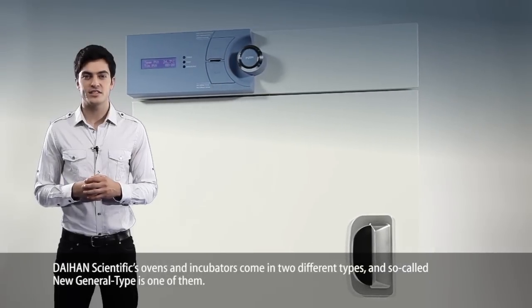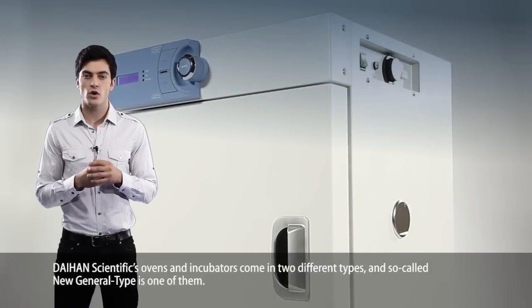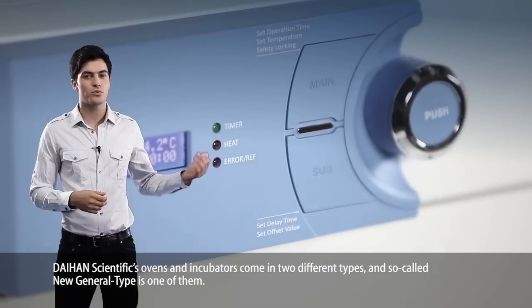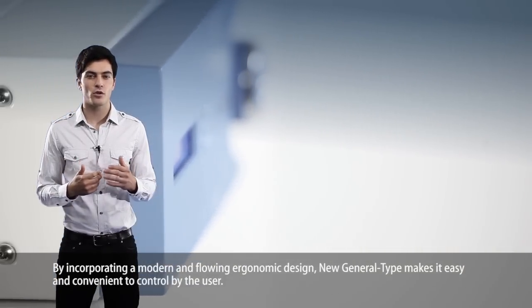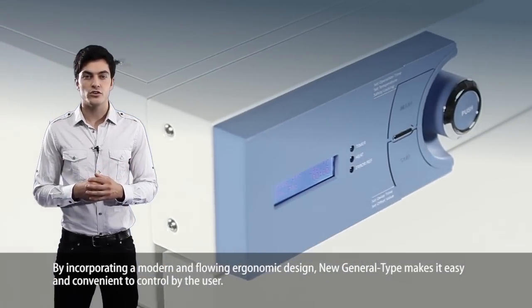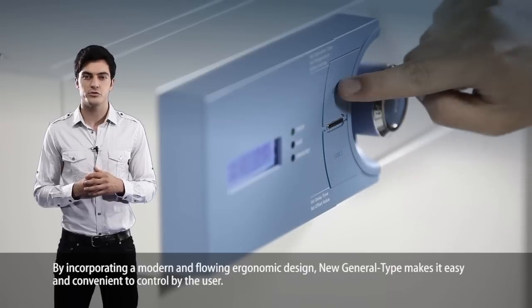Dayhan Scientific's ovens and incubators come in two different types, and the so-called new general type is one of them. By incorporating a modern and flowing ergonomic design, the new general type makes it easy and convenient to control by the user.